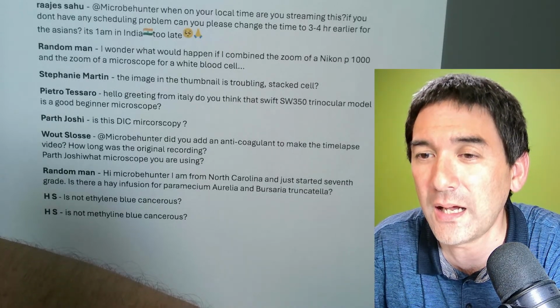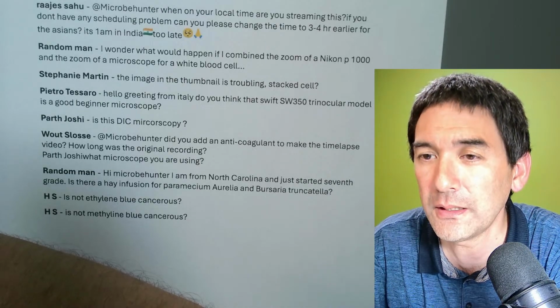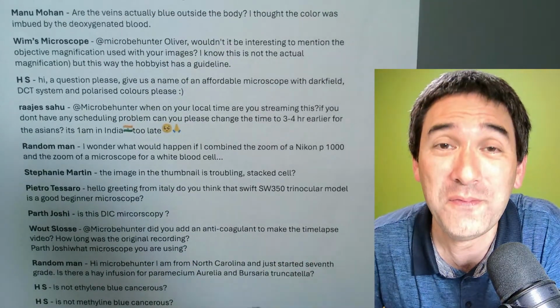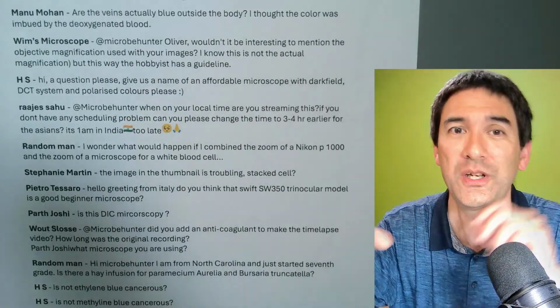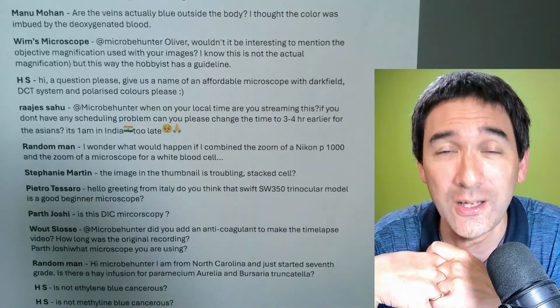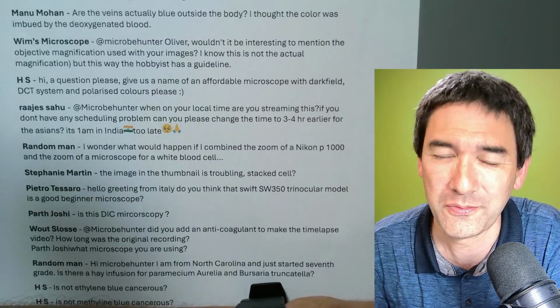Okay. Yeah, exactly. The Giemsa stain is the common one that's normally used for blood. Yeah. The scale bar. Yes, that is also a thing concerning the magnification again. The reason why I'm not using this, especially for my videos, is because sometimes I make a video and then I zoom in more so that the cell or whatever I want to show kind of fills the screen or the video nicely. So I'm adding some additional zoom. And this would actually mean that I would have to calculate a new scale bar every time. Yeah, and this is something I also didn't want to do, for time reasons.